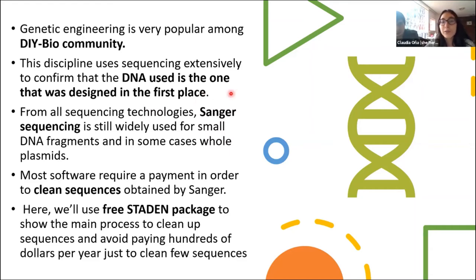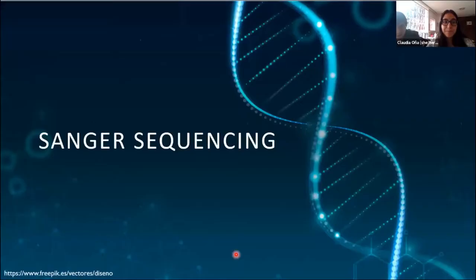So from all of the sequencing technologies, Sanger sequencing is still widely used for small DNA fragments and even in some cases for whole plasmids. But most of the software requires payment in order to clean sequences obtained by Sanger. So in this workshop, we are going to learn how to use this free package to avoid paying for this work. So we are going to learn more about Sanger sequencing.